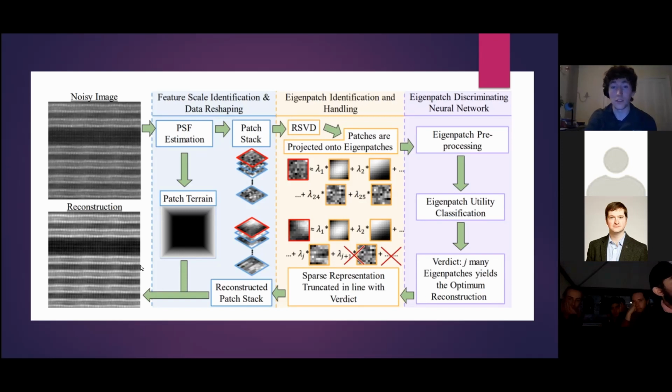What that lets you do is, when you're going through your stacks, if at the microscope another image has finished scanning, you can return the intermediate result by calculating this on the fly, not going through all the patch stacks. Like in the example I gave previously, there was 7. Here you could cut it at 3 and take that image and present it out as it stands. It oftentimes works pretty well, and again, it enables a major speed up.